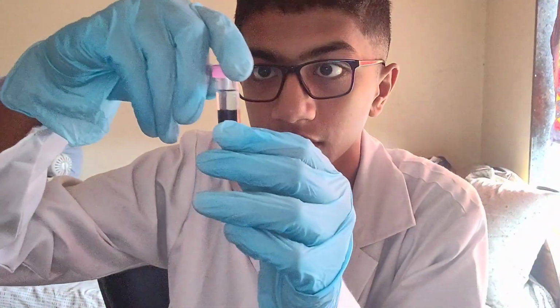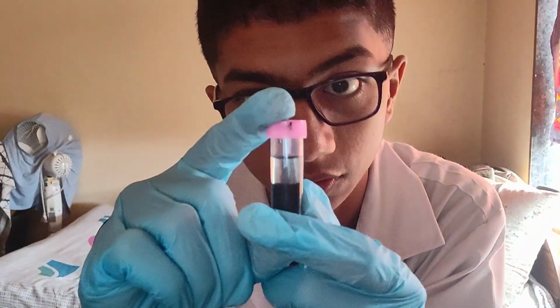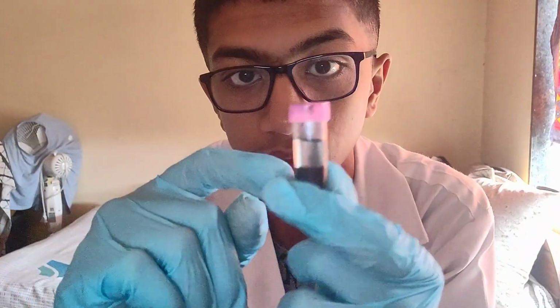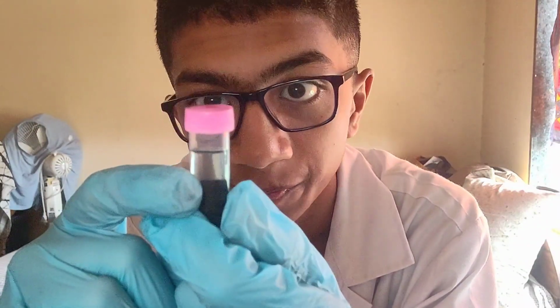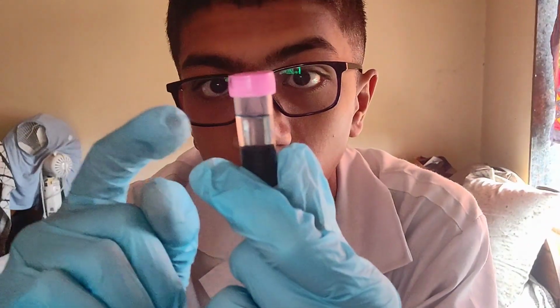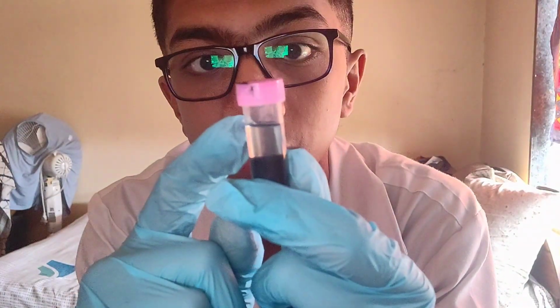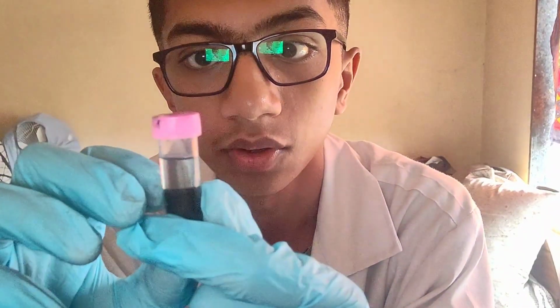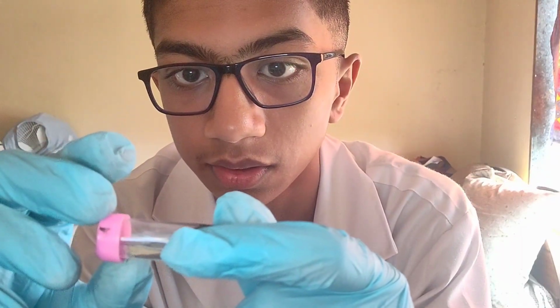Okay, so when I left this off yesterday, what I have noticed is, look at this. The water, and maybe it's a mixture of water and ethanol, since I can see it's a bit tinted in the blue color. I can see a little bit of graphite suspended in there, and below that I guess all of the extra graphite material has fallen out of suspension.